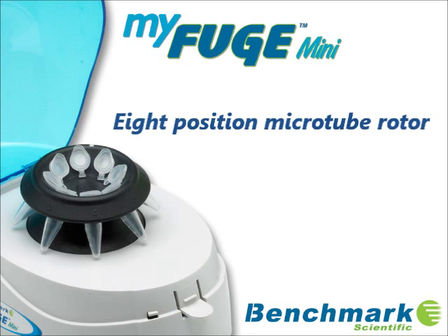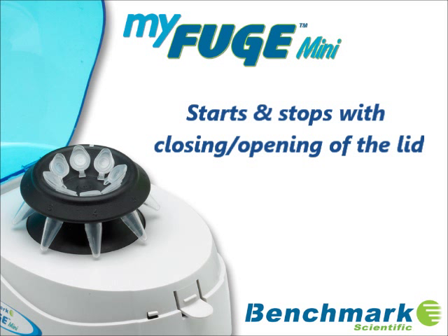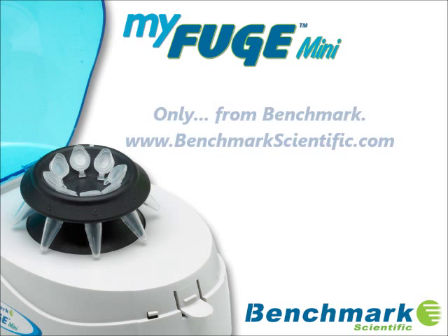The MiFuge Mini centrifuge makes quick spin downs easy and saves valuable time when compared to the operation of a high speed microcentrifuge. For additional information on the MiFuge Mini or any Benchmark Scientific product, please visit www.BenchmarkScientific.com.